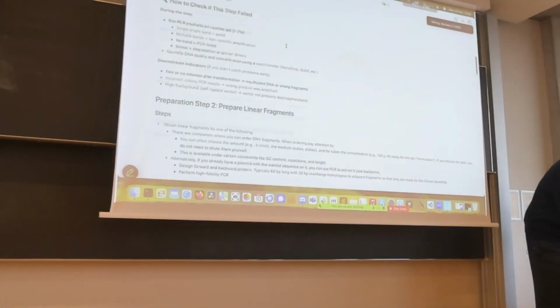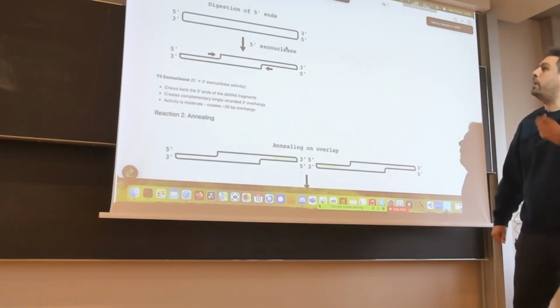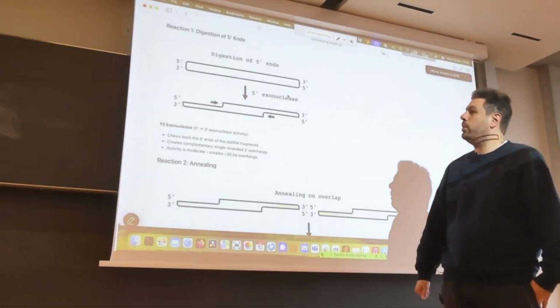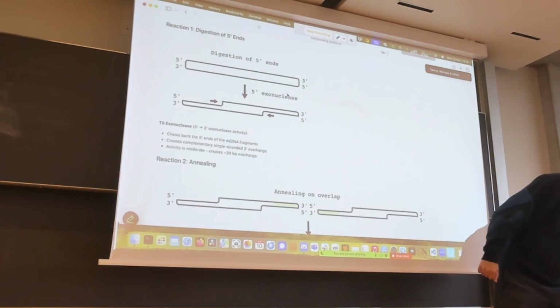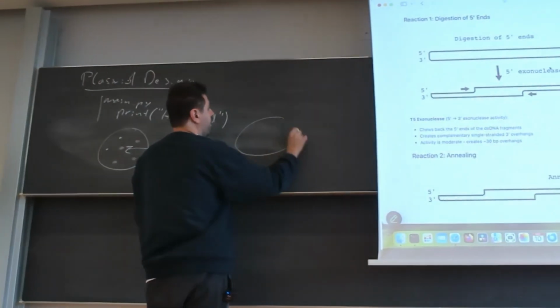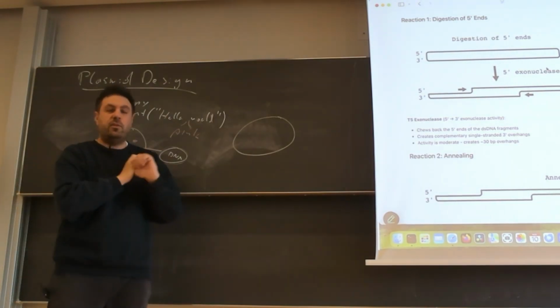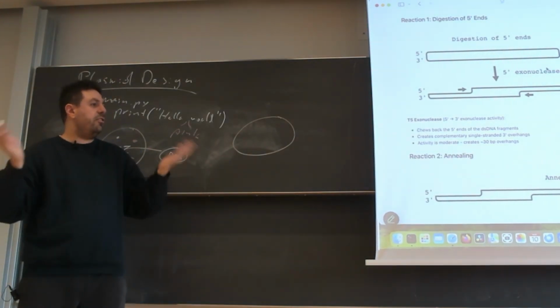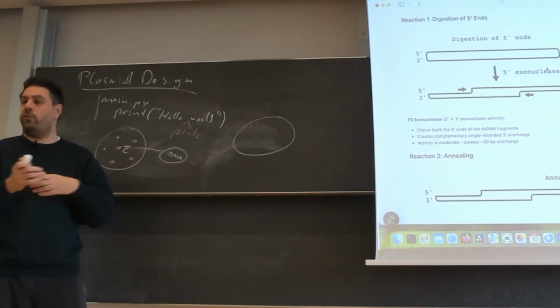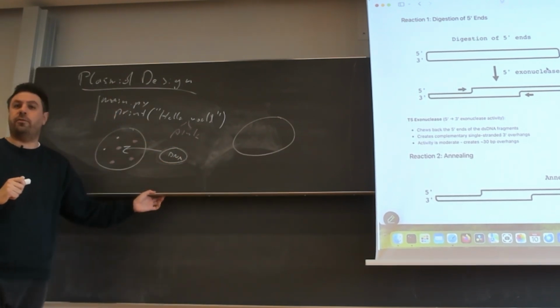Perhaps one thing I want to say, just a very few words about this, or let's look together at these figures. A very big part of this is Gibson cloning. How we are going to design that is we will take a backbone. So we will have a plasmid that has the basics on it. What are the basics? This includes the origin of replication, perhaps some antibiotic resistance gene, a promoter that expresses this, and so on. It's not super full, but it has a few things just to survive.